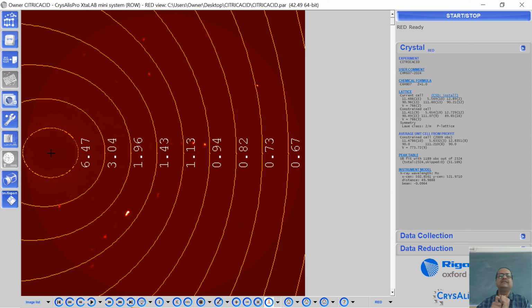In that case, what you will get is some concentric rings all throughout your circular detector surface. That also indicates that the beam stop is not aligned properly. The beam stop is not holding the beam in the middle of it. The beam is coming and hitting somewhere at the edge. So then also one has to correct that.